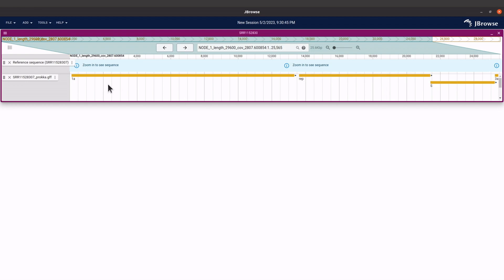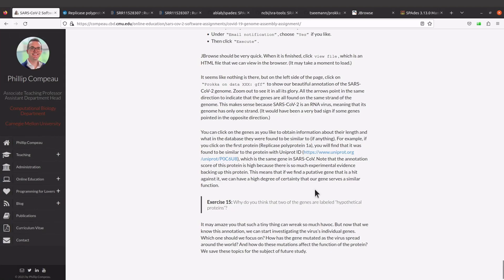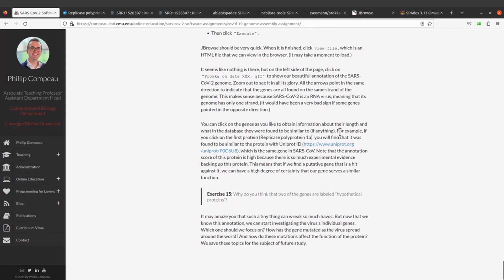The tutorial also makes another statement we should check. It says you can click on the genes to obtain information about the lengths and what database they were found to be similar to. For example, if we click on the first protein, the name has been given here. You will find that it was found to be similar to a protein with a UniProt ID. Let's get back and check first.